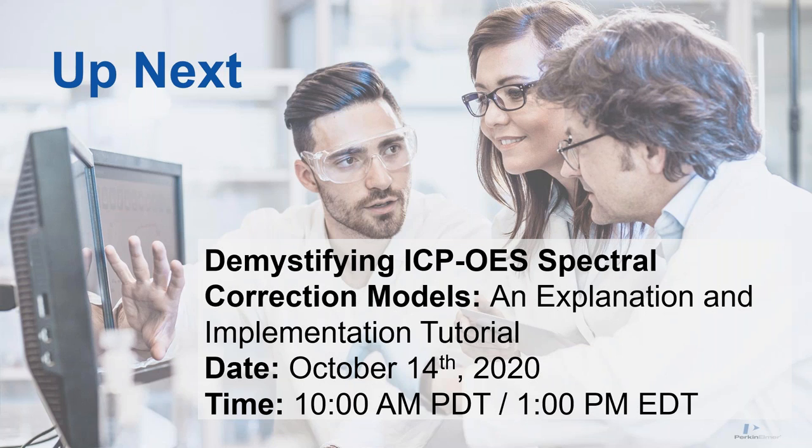I prefer singles, and for some of these sample types, 1,000 won't cut it, right? You need to buy a 10,000, and sometimes I've bought higher personally, and then I dilute it into the matrix as well, sometimes if there are matrix effects associated with the sample preparation or type. If you can source a material that has a certificate of analysis that acts as a good reference for your interference, that's the best way for sure for OES.